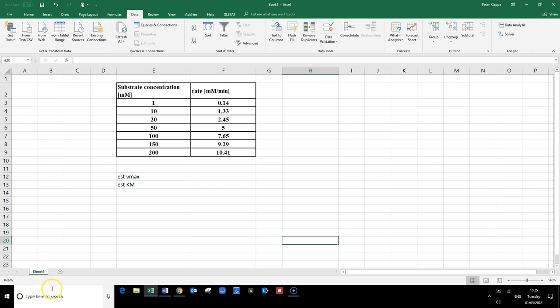In this video clip I want to show you how we can harness the power of a spreadsheet program, and in particular of an add-in, to analyze experimental enzyme data.